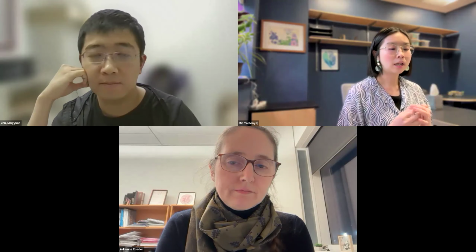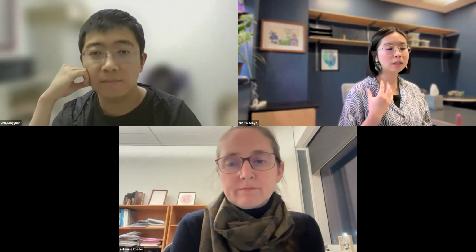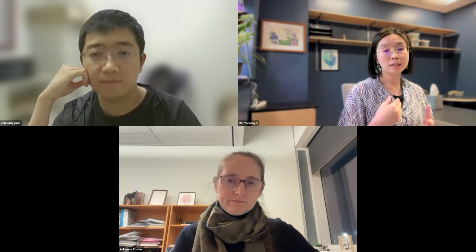And then for collecting the confocal image, it's a trade-off between quality and time. So sometimes if your Z-stack is very, very fine, the quality of the image will by default be much better. But again, if you're doing live imaging, you probably don't want to spend that much time on the confocal for your laser to zap the tissue. So it's a delicate balance. And I think for each sample it is different, so you have to experiment with different types and lengths of time to figure it out.